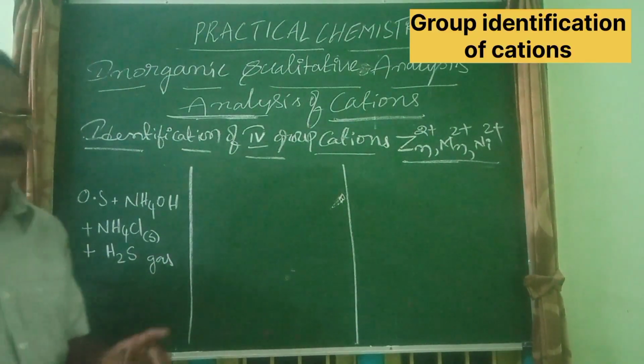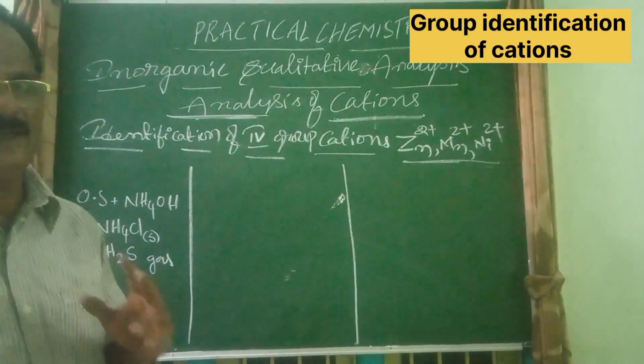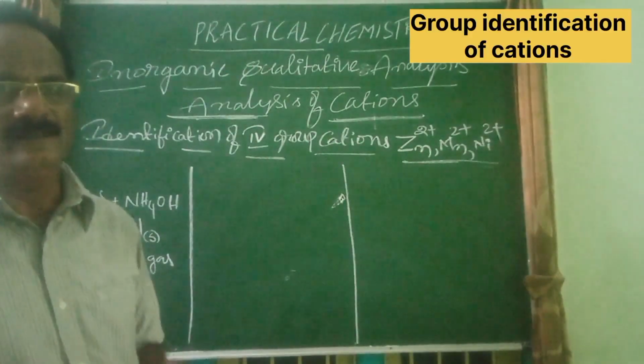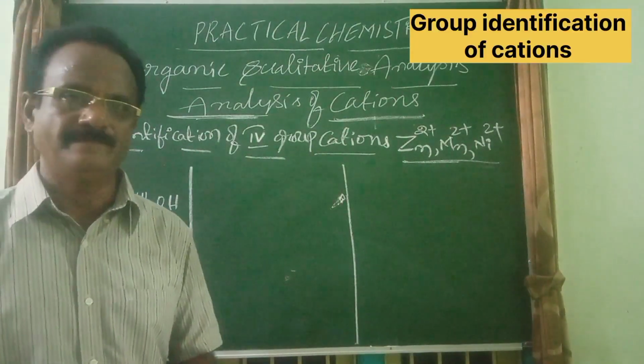Keep in mind, during identification of second group cations, we added HCl and then H2S. So there we took H2S in acidic medium.